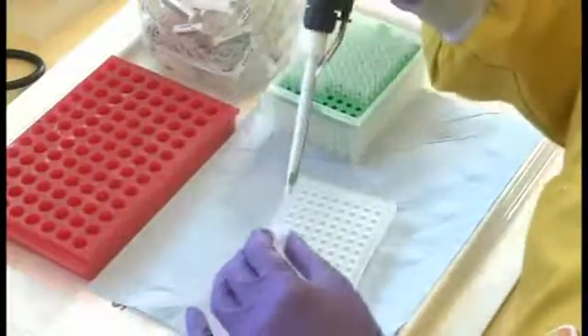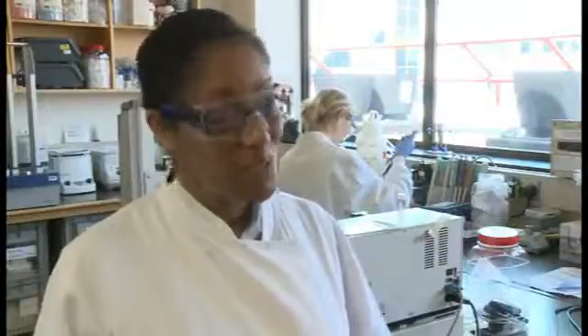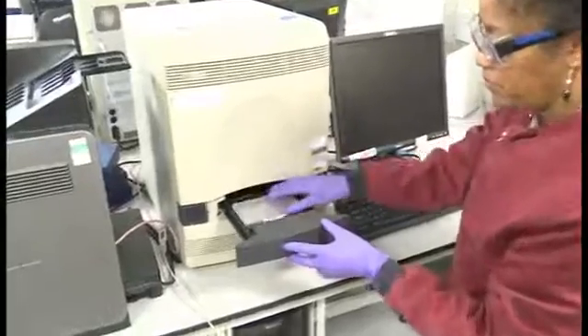We now have our DNA so we are ready to do the final step of detecting influenza virus in a polymerase chain reaction. Having set up the PCR plate, I have just put the plate in a centrifuge and that mixes all the components of the reactions and forces the mixture down into the bottom of the tube. I'm now going to put this into the PCR machine.